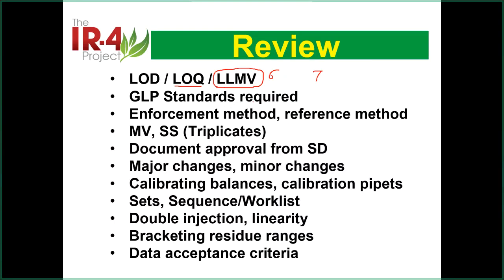Then we talked about the standards, which must be GLP. If the standard is not GLP, then your work may not be accepted. Next we talked about the reference method. Sometimes we call that the enforcement method, because the government will require these methods for certain work like registration and monitoring. You can also develop a method yourself, but that's another area, so we are not talking about it here.